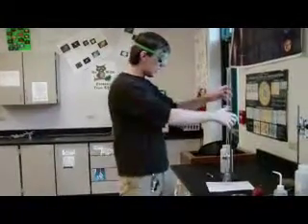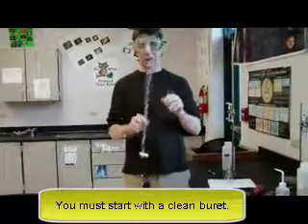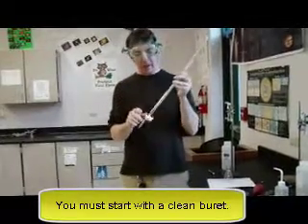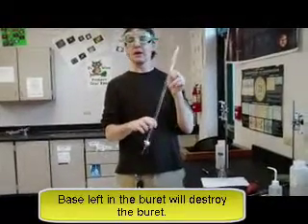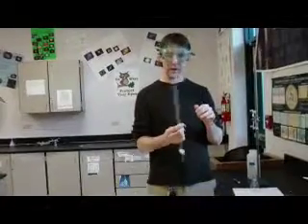Let me show you now how to get this set up. With the burette, the very first thing you need to do is rinse it. You're going to rinse before you start, and you're always going to rinse after you're done. If you leave base in the burettes, it starts to warp the inside by digging away at the glass, and they're no longer accurate. So never leave an unclean, unrinsed burette lying around.